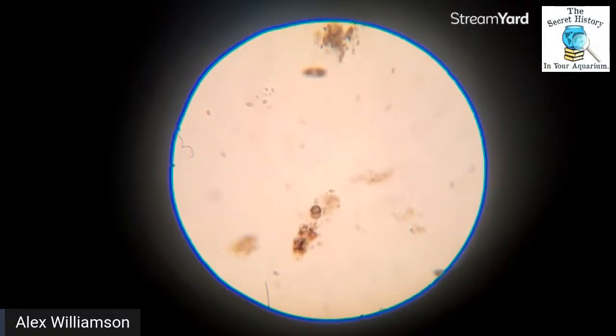It's kind of hard to see, but it's in between the two darkest spots on the lower part of the screen. There is a little clear worm with its head poking out above the two dots and its body wrapped around the lower brown spot. I don't know if it's eating whatever those are, but I'm not getting much clearer. Let's try the fine focus. I'm not getting a whole lot of a clearer picture on them, no matter what I'm doing here. So they might just be a little clear organism.